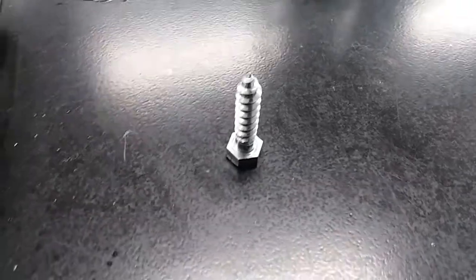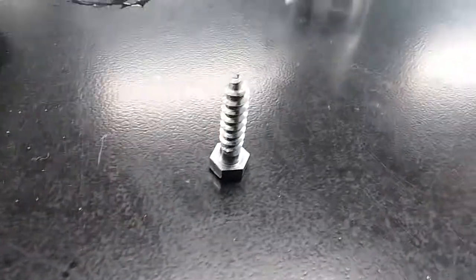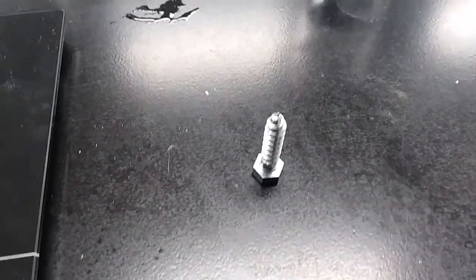Let's say I wanted to measure the density of this object here. How would I do so? First, I'd start by finding the mass.